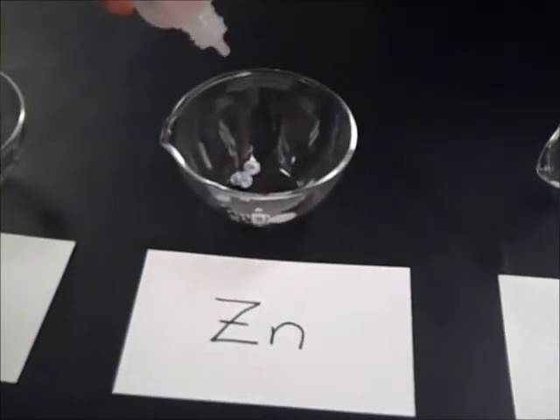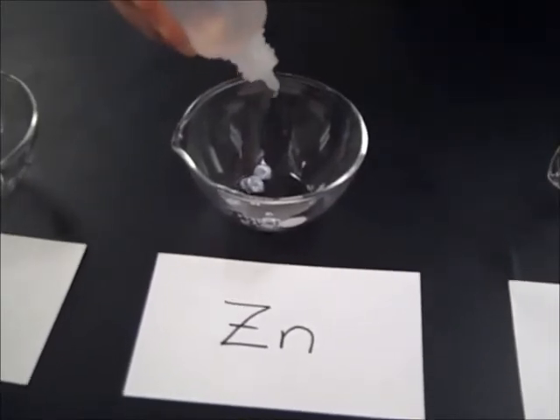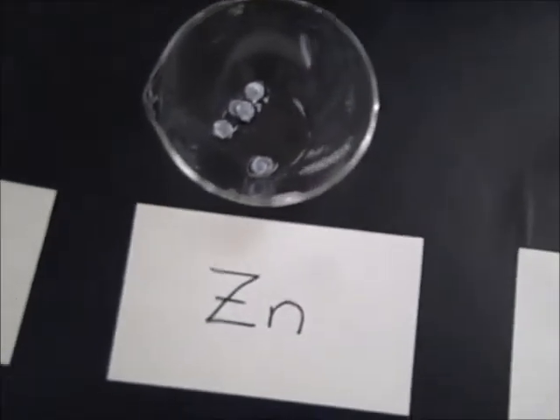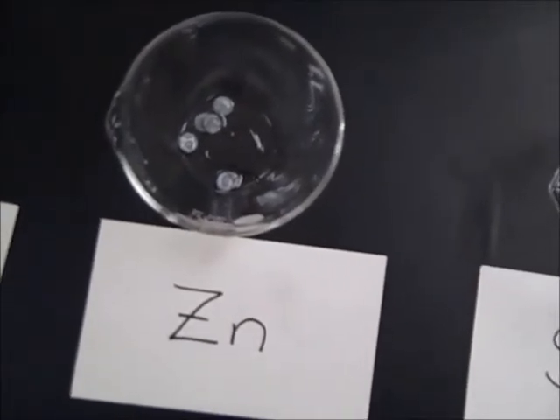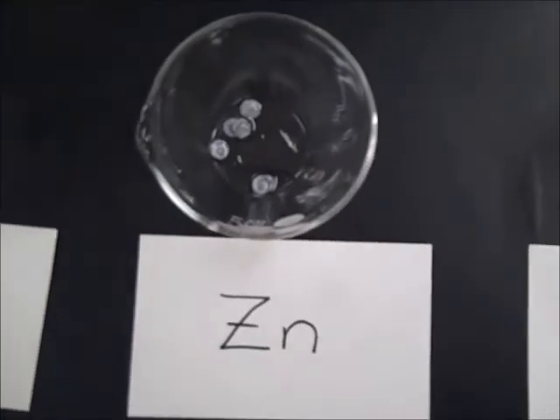Zinc. Should I keep adding? Yeah, go ahead. Can you get in there and see that there is some reaction in there? It's not as exciting as the magnesium.